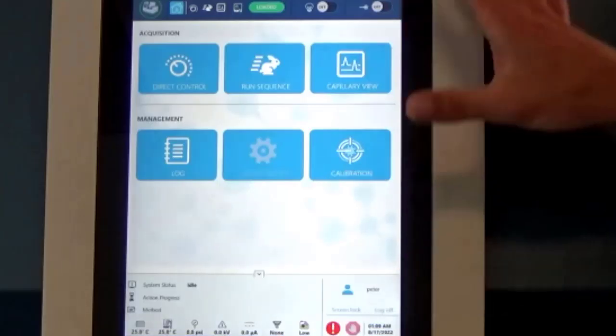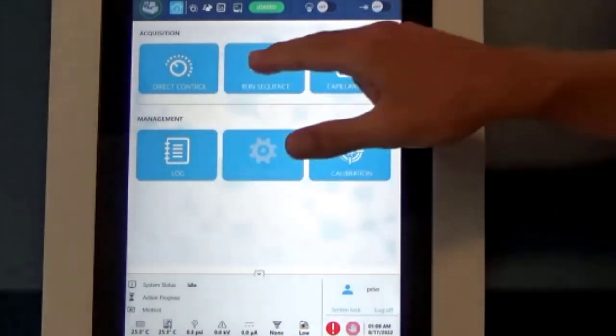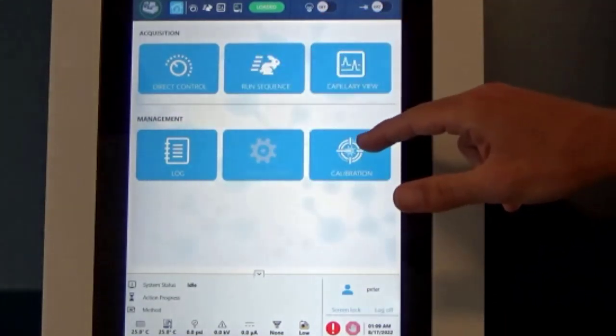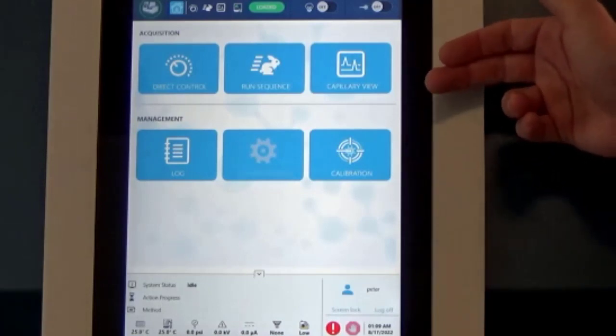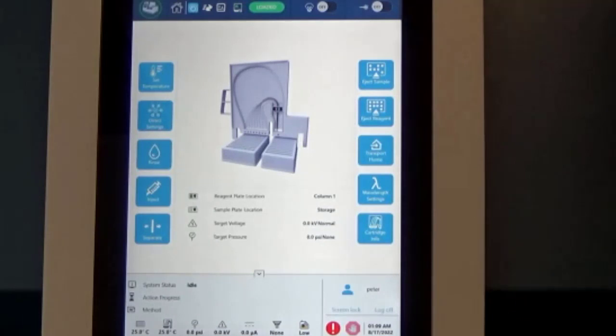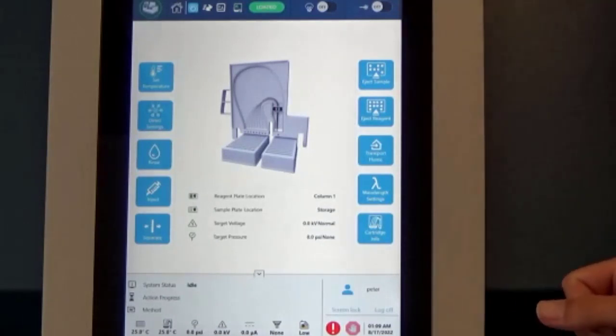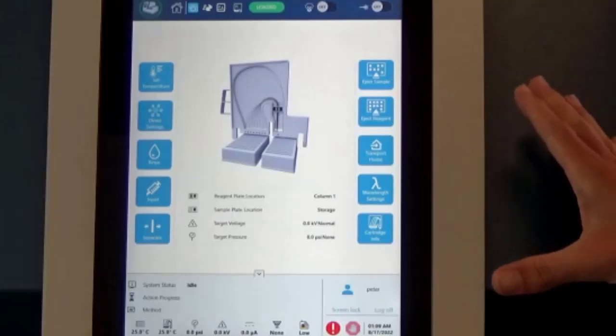And we're going to take a look at the touchscreen. So here, we can see the touchscreen on the BioPhase 8800. We see a few different tiles, and each tile gives us different control over the instrument. If we click this first tile, this direct control tile, for those of us that are used to 32 Karat or even Empower controlling our PA 800 Plus systems, these look very familiar, much more graphical.